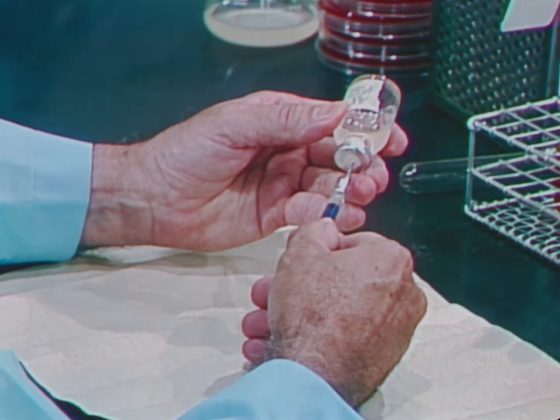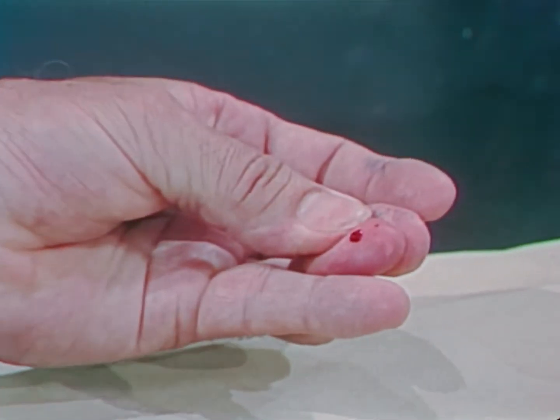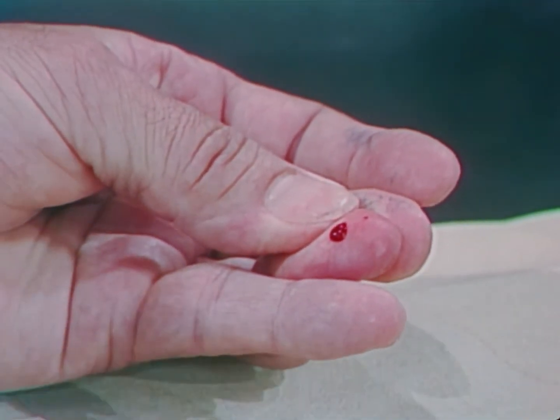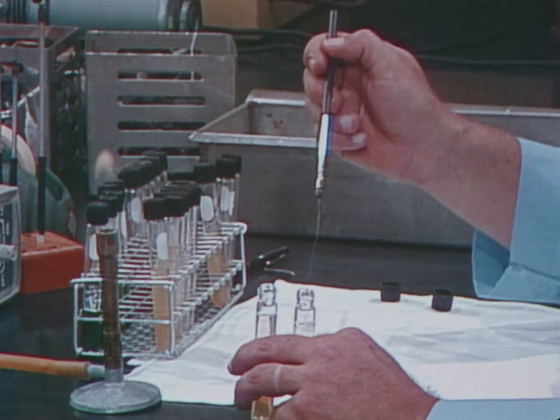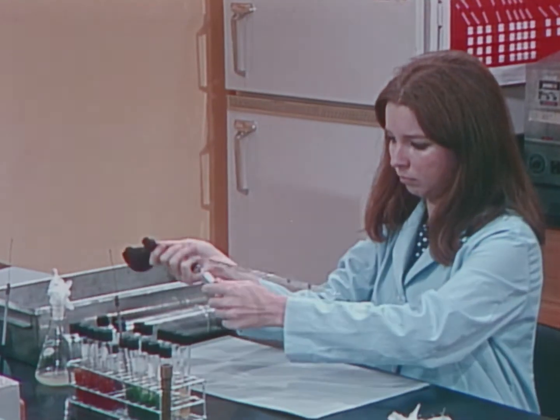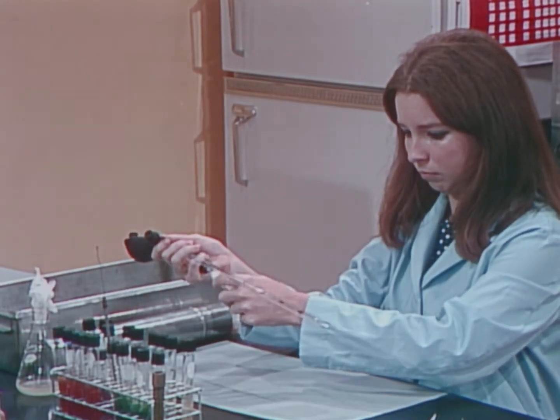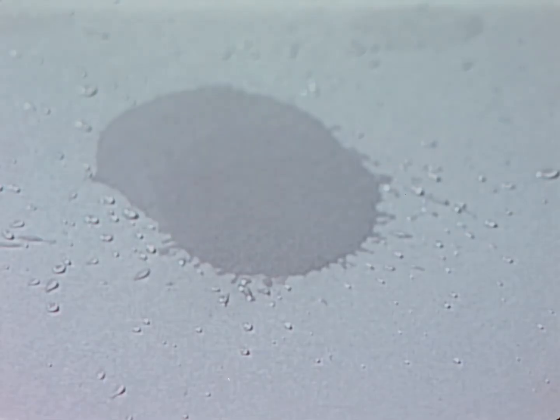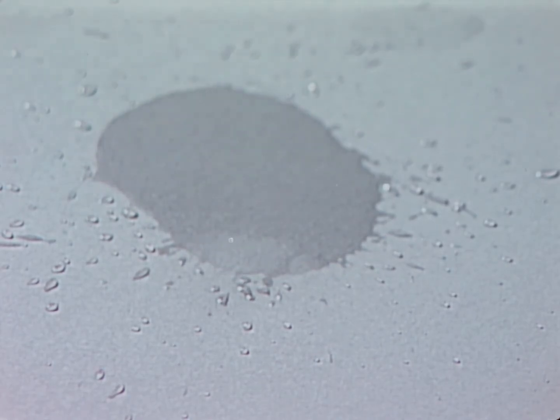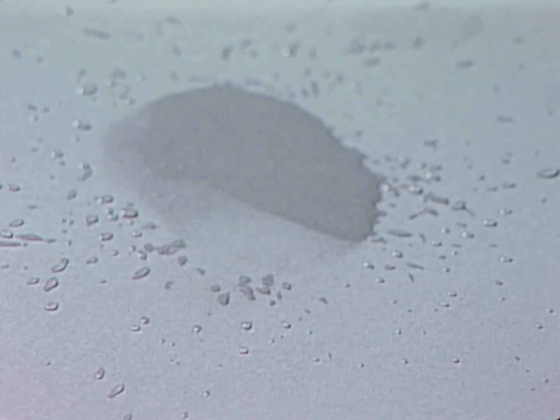Of 4,000 cases studied during the past 50 years, only 20% have been identified as resulting from known causes. 80% of the cases investigated resulted from unknown causes. Most investigators concluded that infections from these unknown causes were due to routine microbiological procedures, including procedures which resulted in producing aerosols which contain microbes. These aerosols were found to be the principal agents contaminating the laboratory environment.